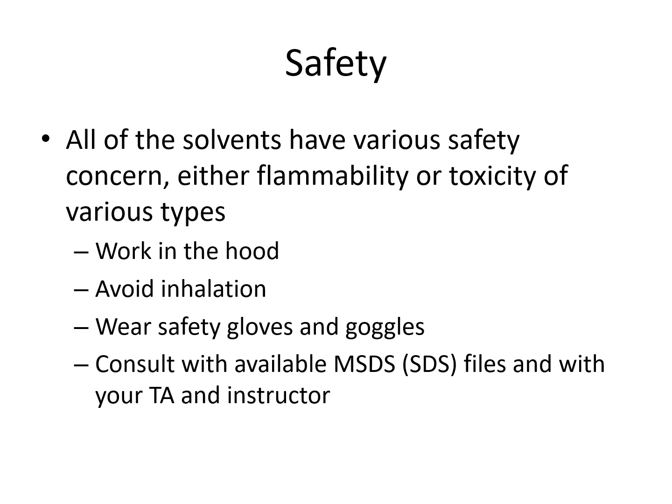Well, safety matters regarding this experiment. If you remember the solvents we use, dichloromethane, ethyl acetate, and 1,2 dichloroethane, all these solvents are flammable and they have health threats, and they shall all be handled in a fume hood. When you do the experiment, you have to hold the beakers or the solvents away from your mouth so that you can minimize inhalation.